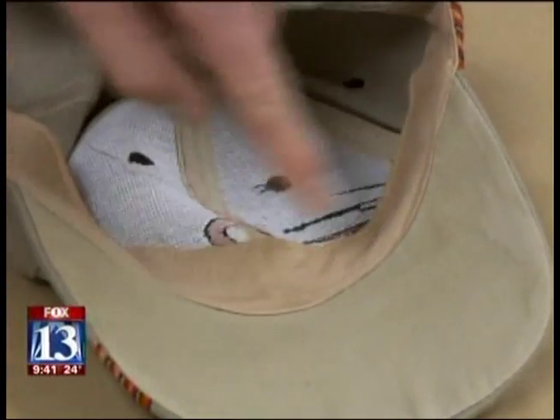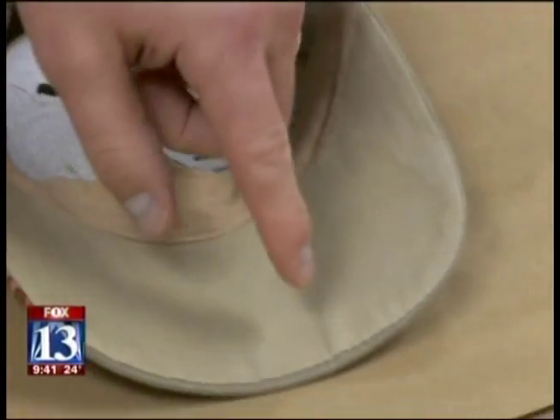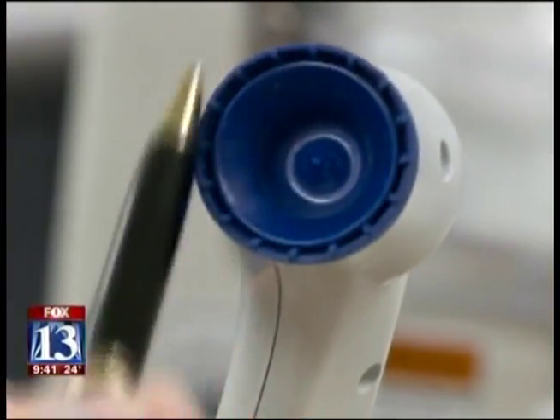The brim right along here is a great place because it's right along the forehead, and it seems like they always touch it like that. Officials say the MVAC has already been used in a few Utah cases with great success, and they hope it will help solve some cold cases that have gone unsolved.